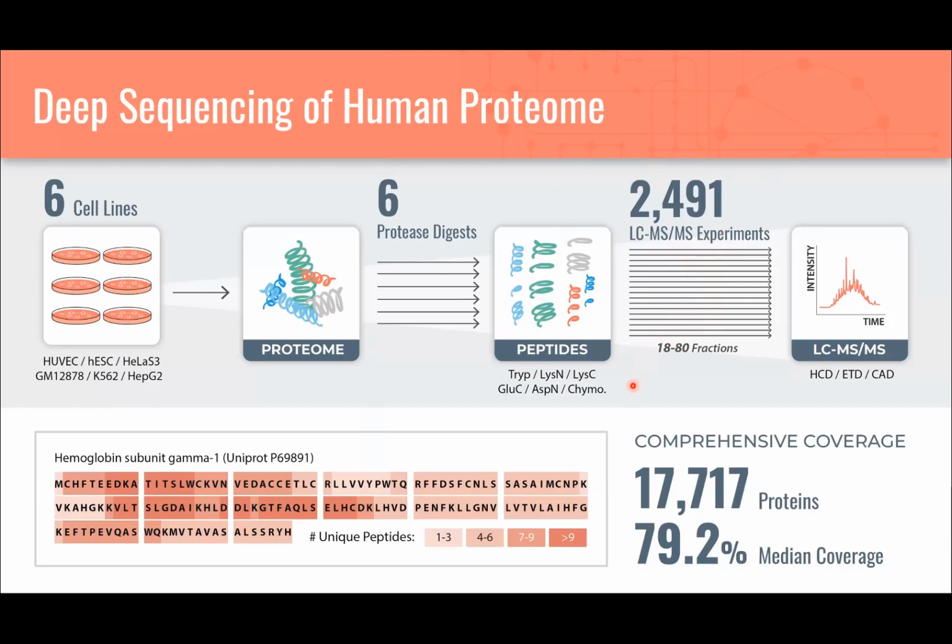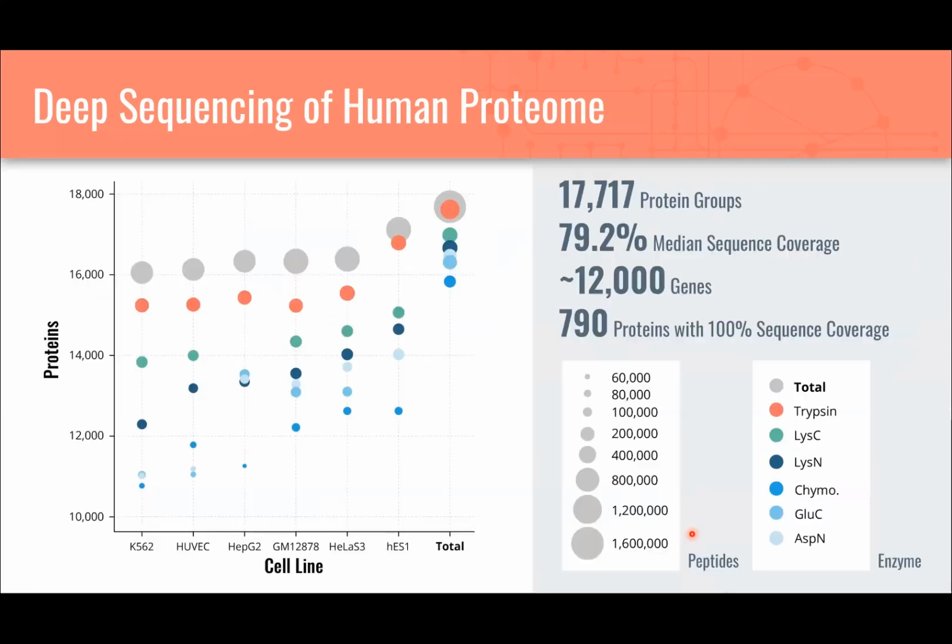You wouldn't do this every day, but if you want to see what the limits of our technology are, it's very exciting to do that and spend that energy. In total, we provide evidence for almost 18,000 expressed proteins collectively in those 6 cell lines, with a median sequence coverage of close to 80% in human cell lines. So we were very excited about that.